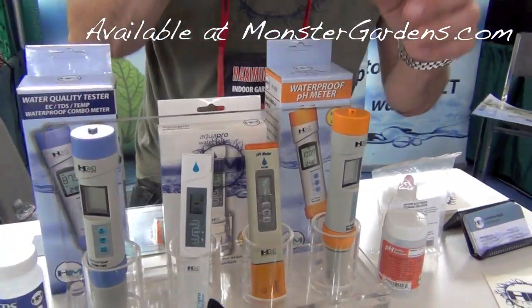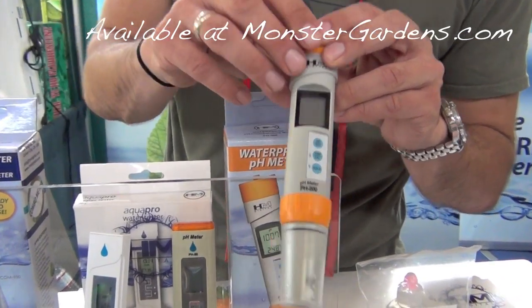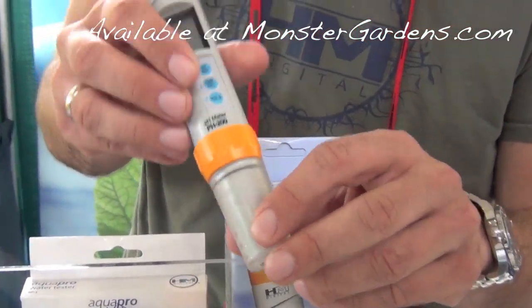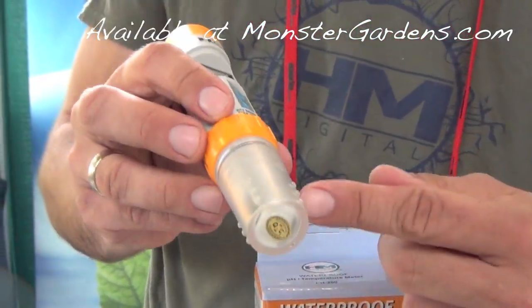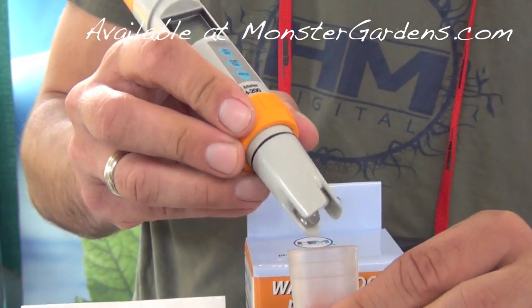Moving to the pH pens. Alright, so this is our sort of sibling meter, fully waterproof submersible, same deal with the replaceable probe. Clear cap so that you can see the moisture on, which is important.